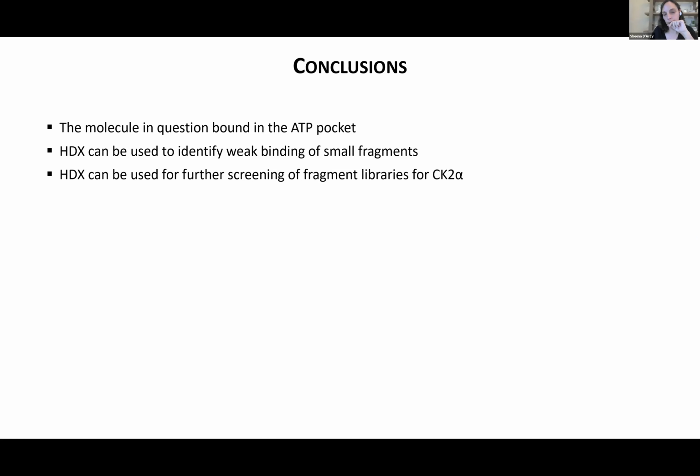Yes, absolutely. I want to clarify that the application that we wrote does not actually do any spectral assignment. What it does is take your already assigned spectra and centroids, apply some statistics and visualize them, and you can customize the pictures. So it's really at that later stage.